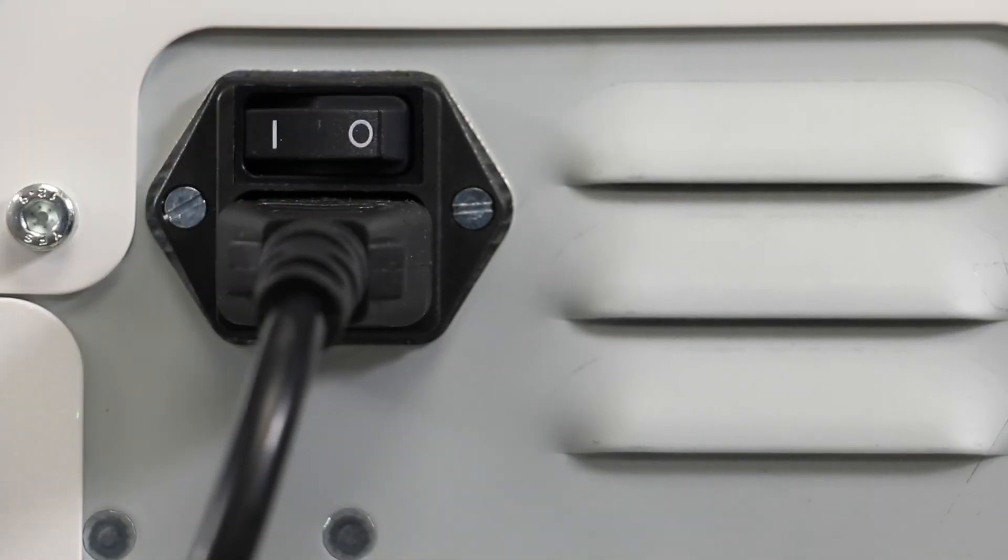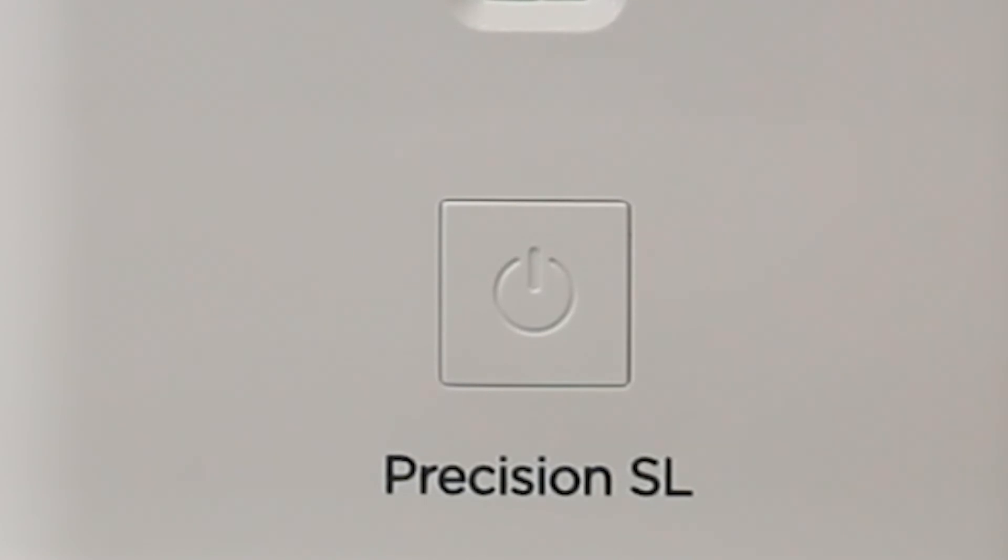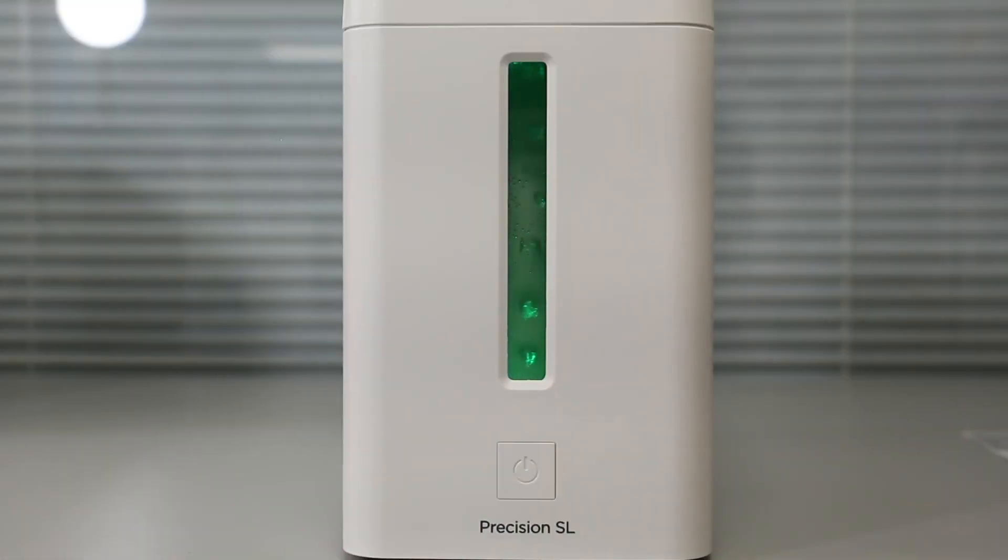Step 8: Power on the generator using the main power switch on the rear of the unit. Once diagnostics are complete, the LEDs will be solid green and the generator will be ready to deliver gas to the application. Press the front button to supply gas to the application.